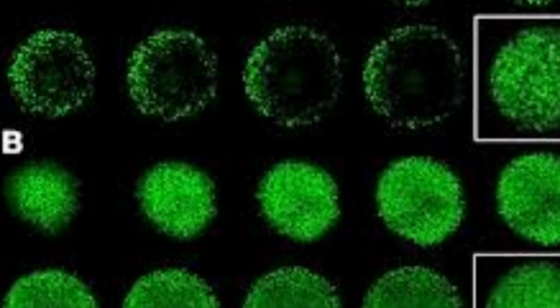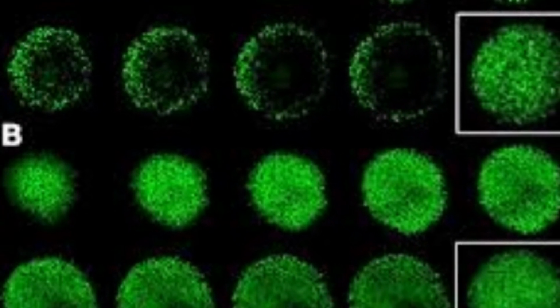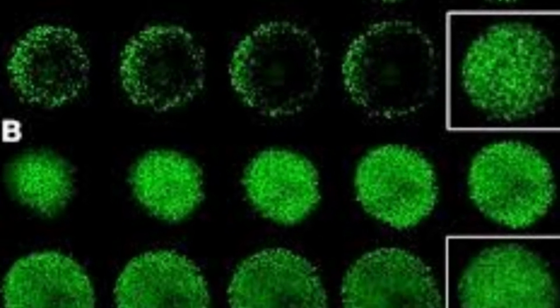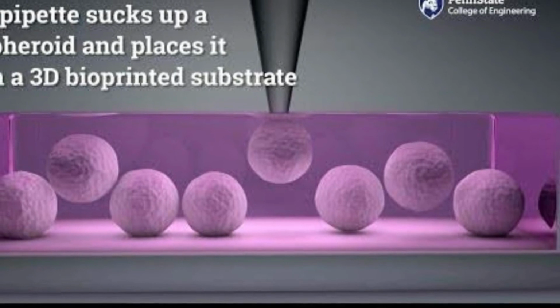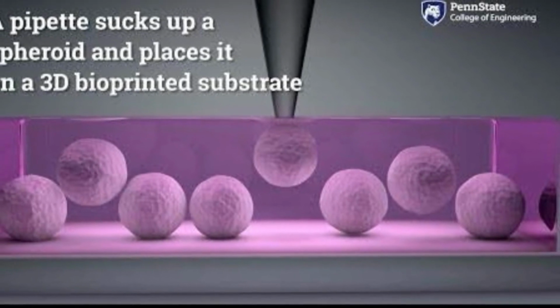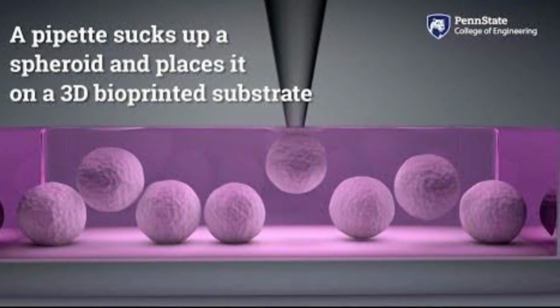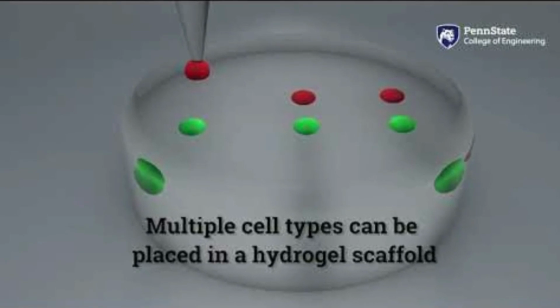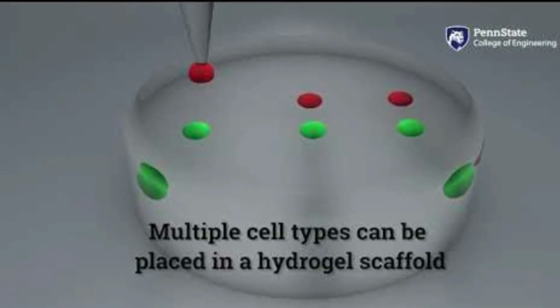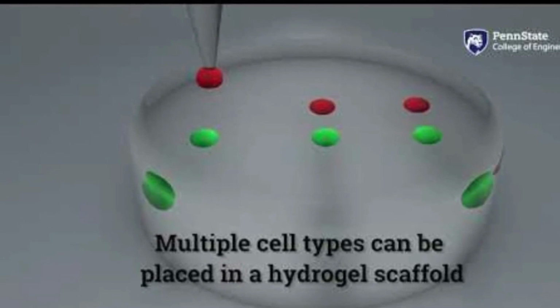The researchers suggest that this method can be cost-effective because the equipment required costs under $1,000 and is easy to use. They report that the system can be useful in a wide variety of applications, including but not limited to organ-on-a-chip devices, drug testing devices, microfluidics, in vitro human disease models, organoid engineering, biofabrication and tissue engineering, biocomputing and biophysics.